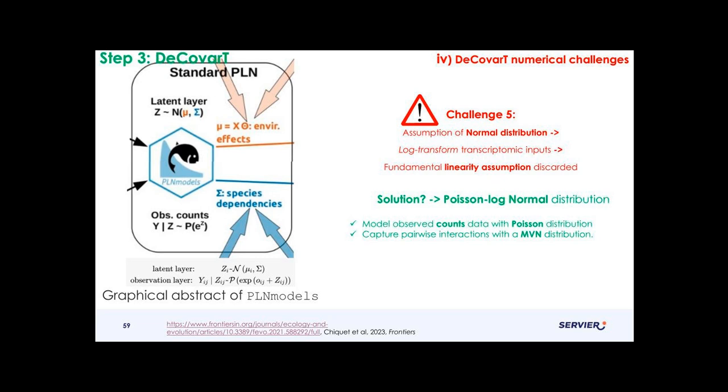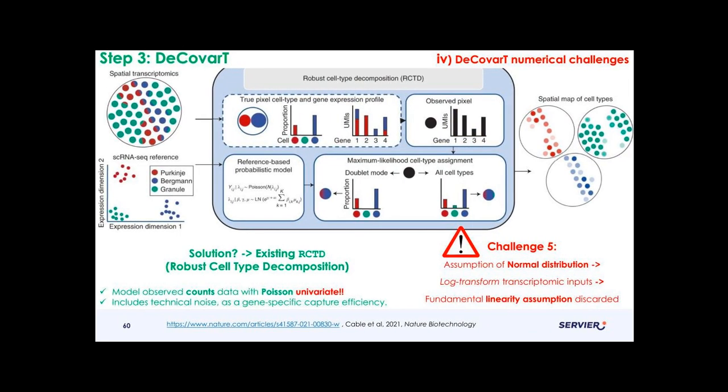Another great thing is that there's this package termed PLNmodels, which is, I think, implemented on Bioconductor, and which provides a variety of approaches to infer efficiently the parameters of a Poisson log normal distribution. As it turned out from some recent benchmarks in spatial transcriptomic decomposition, and I would say there are really some similarities between bulk transcriptomic decomposition and spatial decomposition approaches, Poisson log normal seems to be relatively efficient for capturing the distribution and to be quite faithful to the nature of your distribution.